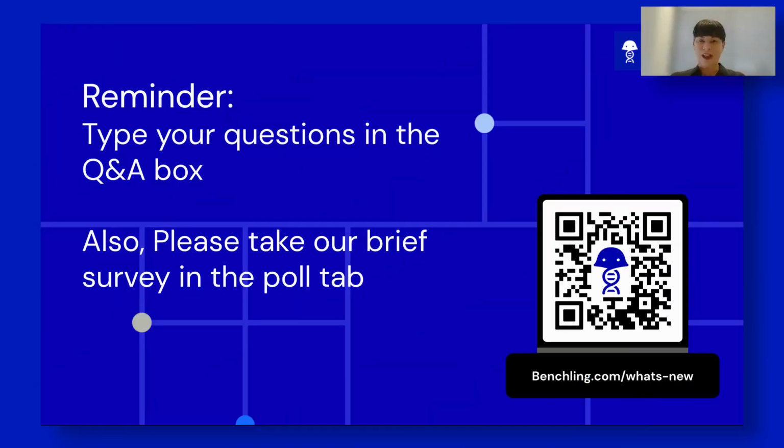Thanks, Johan. Another fantastic presentation. A quick reminder to our attendees, if you have any questions about any of the mRNA or sequence design things that were just presented, feel free to ask them in the chat and we'll get right to this. And at the end of the webinar, we're going to have a little poll. We'd really appreciate your feedback so we can make sure we're delivering the information you need in these kinds of webinars.